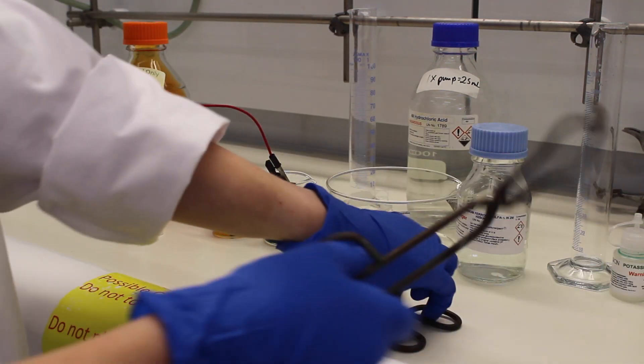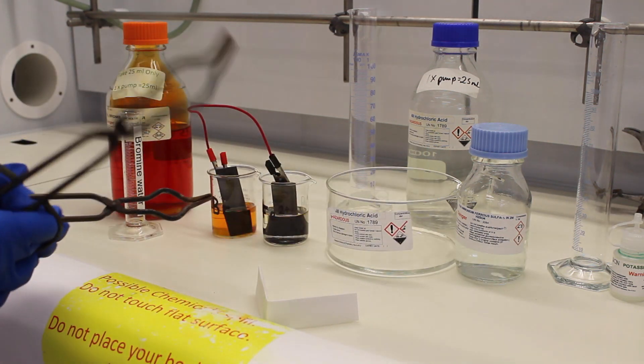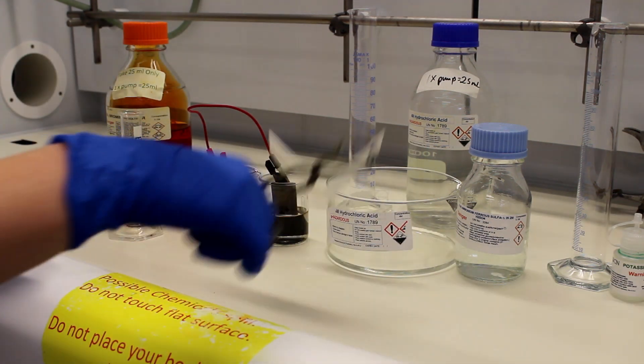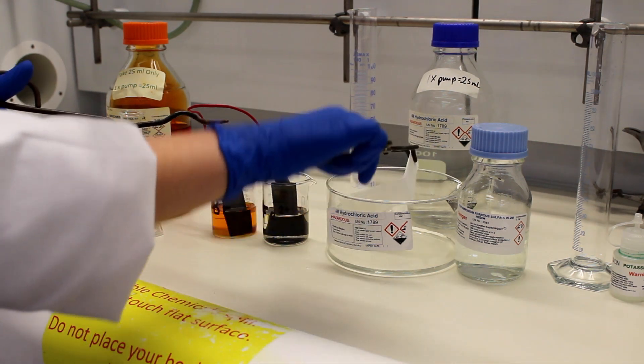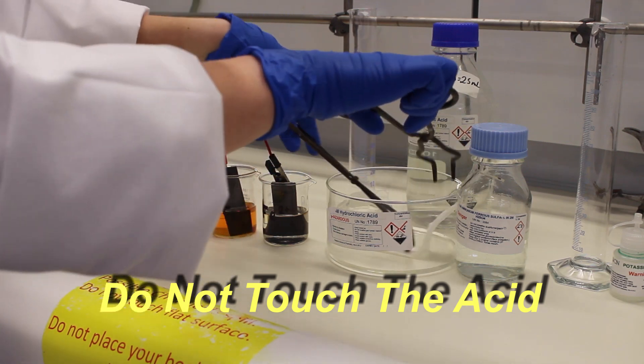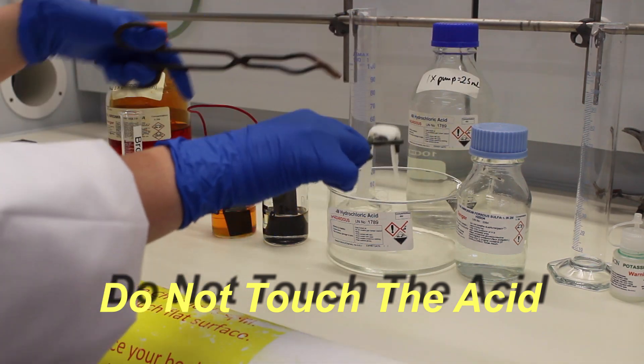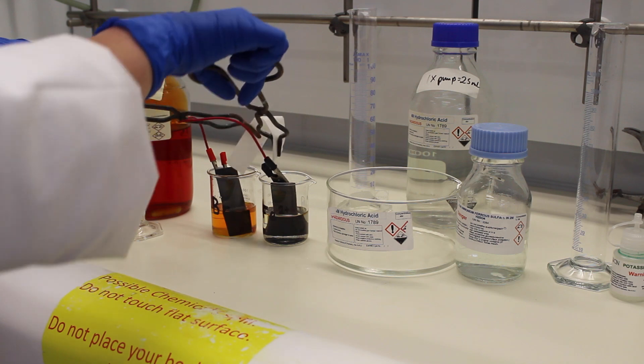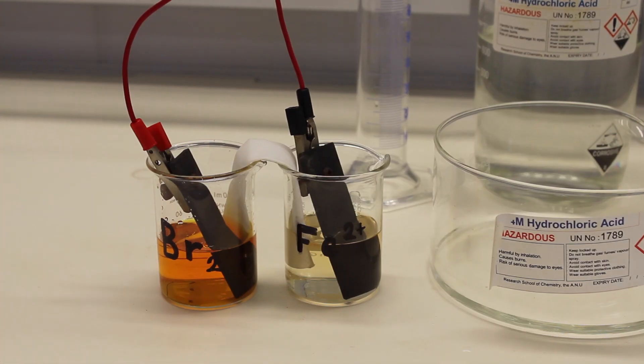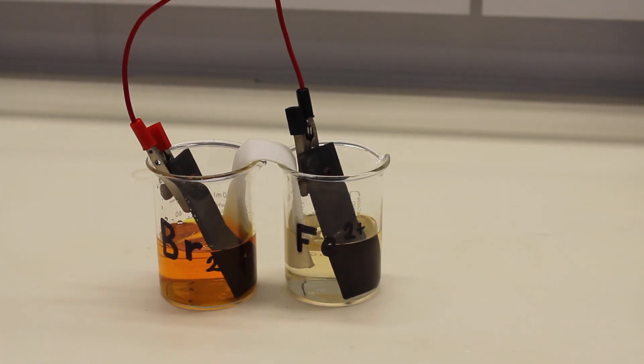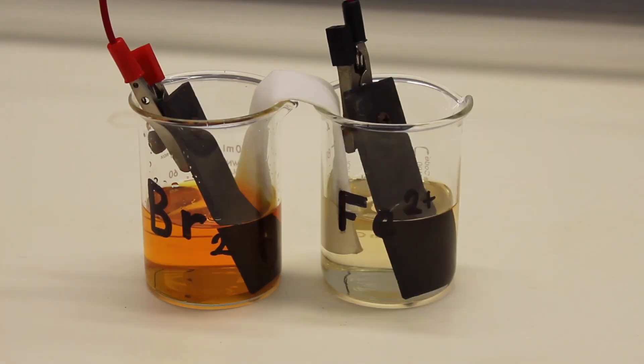Fold your filter paper in half and moisten with 4 molar hydrochloric acid, being very careful not to touch the solution. Once your paper is moistened with the acid, place it between the two beakers and this will act as your ion bridge. We'll leave this setup running and check back on it later.